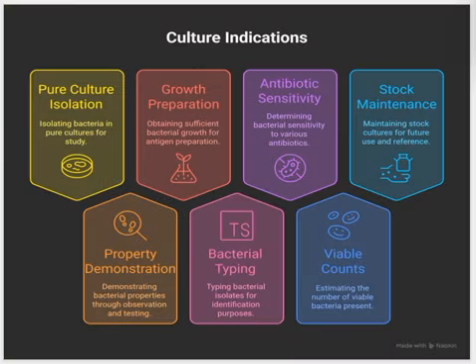So, why do we use culture techniques? There are several important reasons. For example, isolating bacteria in pure cultures helps us study them in detail. Sometimes we need to grow enough bacteria to prepare antigens. We also test how bacteria respond to antibiotics, which is crucial for treatment decisions. Maintaining stock cultures ensures we have reference strains for future work. Additionally, cultures help demonstrate bacterial properties, type isolates for identification, and estimate viable bacterial counts. Each of these uses highlights the versatility of culture methods.